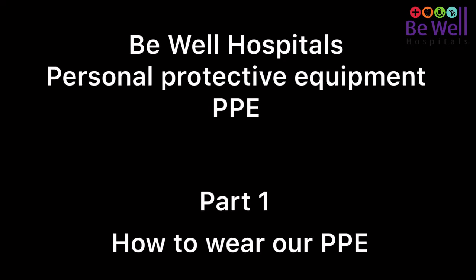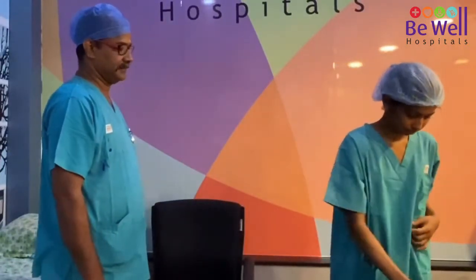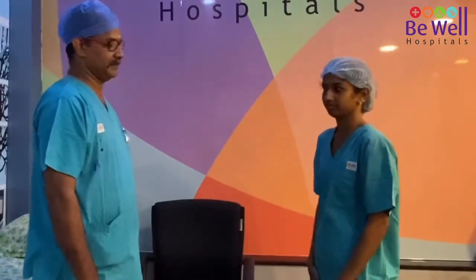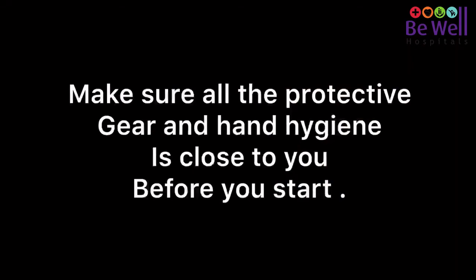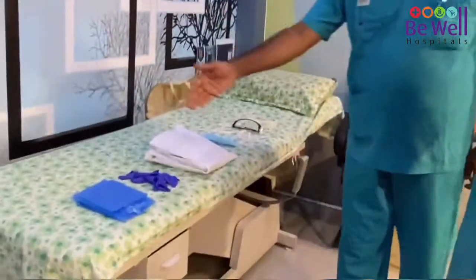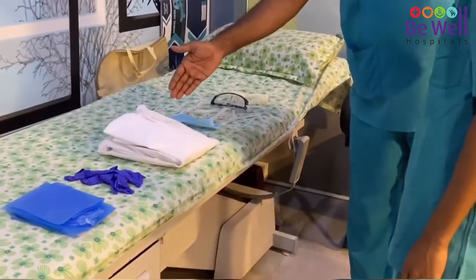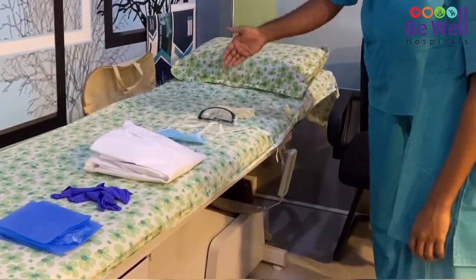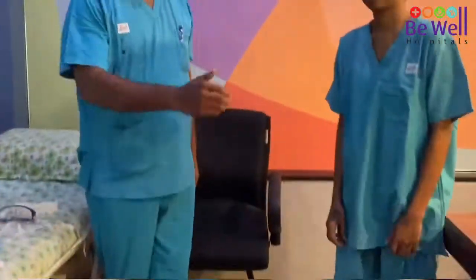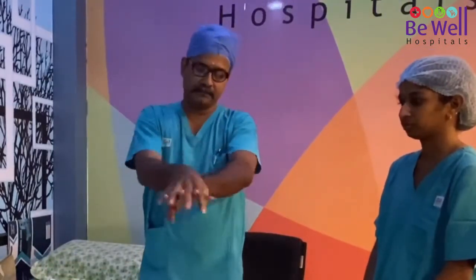Bewell Hospitals Personal Protective Equipment tutorial. Always first keep your personal belongings in a safe place, and once you have done so, check that your pockets are empty. Make sure all the protective gear and your hand hygiene supplies are within reach before you start wearing your PPE. You should remain in one place throughout the process. This is a demonstration of hand hygiene by Satish, our theatre staff.